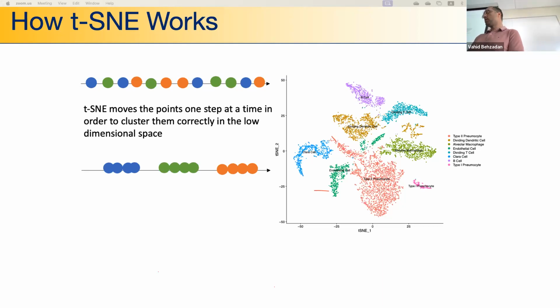You need to see some phenotype or something happening in the biological system that you cannot explain, and then you go and investigate the role of these cells. But with this computation, as I said, you make so many assumptions. You can't be confident that this cell is something unique. The simplest assumption is that this cell belongs to the closest cluster.